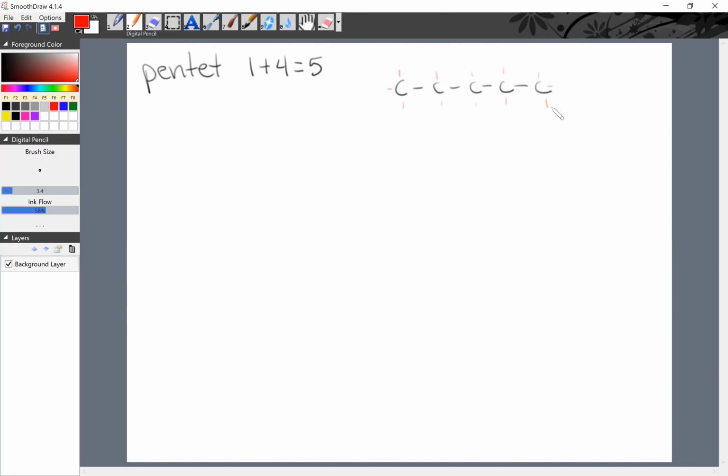All right, let's look at this particular molecule. Now there is a plane of symmetry, okay? So we're going to expect 1, 2, 3 peaks. That's a C. We are going to expect this one, A and B are identical. So this one, just reviewing, is 6 hydrogens for the integration. This one is 4 hydrogens for the integration, and this one would be 2 hydrogens.